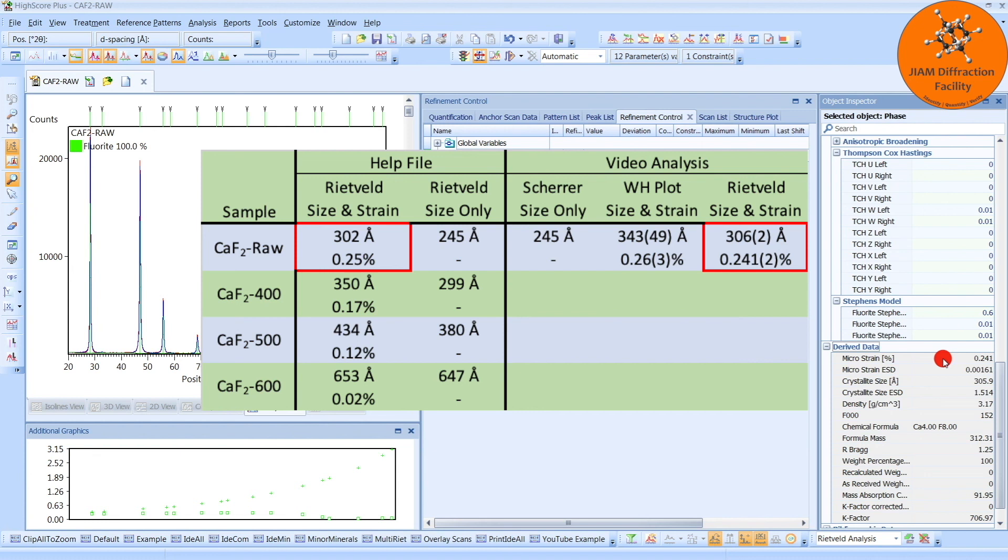If you compare the results obtained by Rietveld Refinement found in the help file and this video, as shown in the red boxes, you will see that they match very nicely.